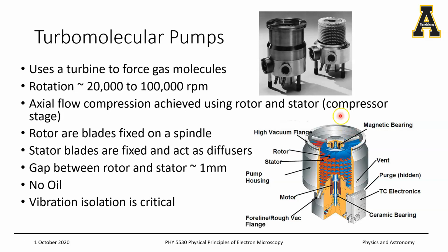So it's important that the vacuum chamber that would be connected on the top end of the turbomolecular pump has already been pre-vacuumed by your roughing vacuum pump with a different line. And also, as I said, for the diffusion pump, here is your roughing vacuum line. So you need to maintain a differential pressure between the top end and the bottom end of your turbomolecular pump.